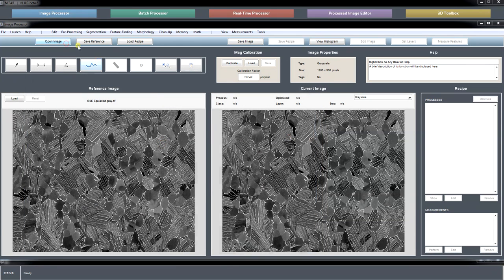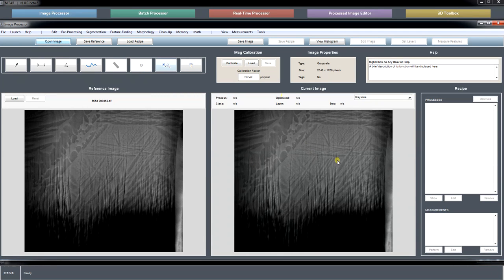So let's open up the second application here, which is going to be getting rid of curtains in a dual beam FIB serial section slice. What's happened here is your ion beam has come down parallel to the image and sliced away a bit of material, but it's left these milling artifacts, we call them curtains, this artificial roughness that now exists on the surface, and that can make processing these images quite challenging. So an FFT filter can be a pretty effective tool here.